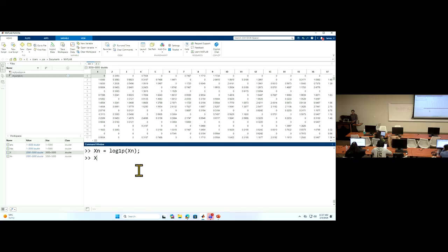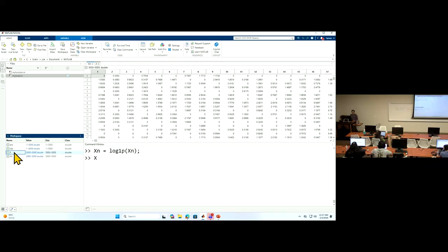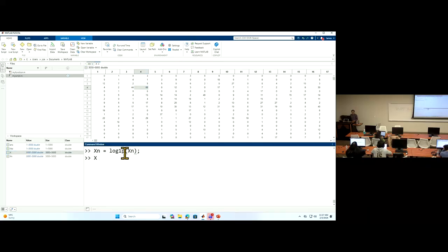So let's just repeat what we did. We have this unnormalized raw matrix. Of course, QC had already been done. All the very extreme empty genes have been removed. Empty cells or poor quality cells will be removed. So this is a basic QC'd expression matrix.